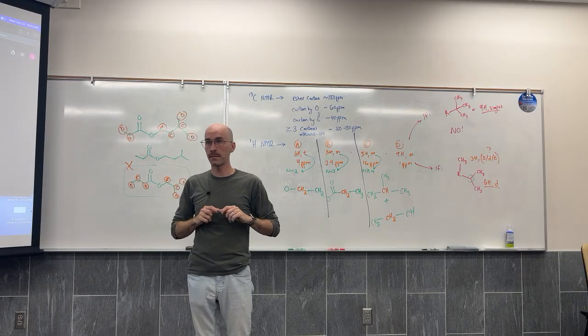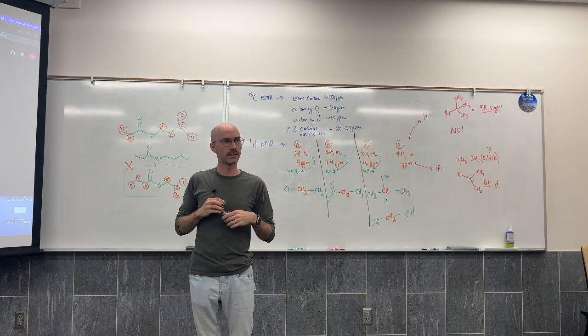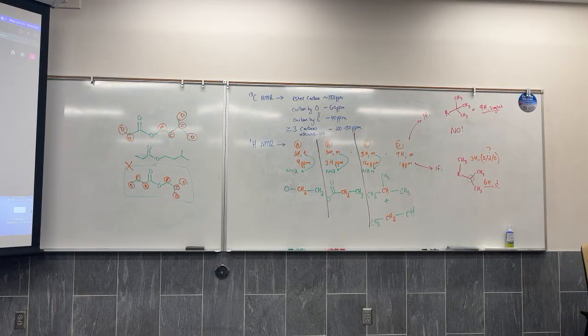Can I tell you something? Don't cheat. On the unit test, don't take that little code that you find in the bottom and plug it in and find the compound and draw the structure. And let me tell you 2 reasons why. I've just done that with this spectrum. It's giving me nothing useful. None of these are actually the NMR spectrum that we're looking at. Even these first top hits are not the structures that we're looking at.